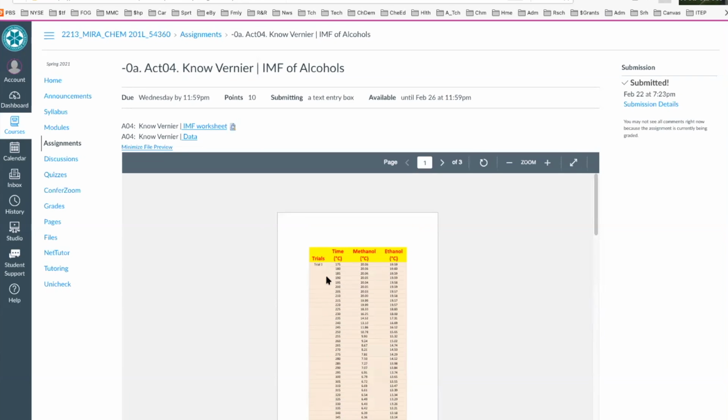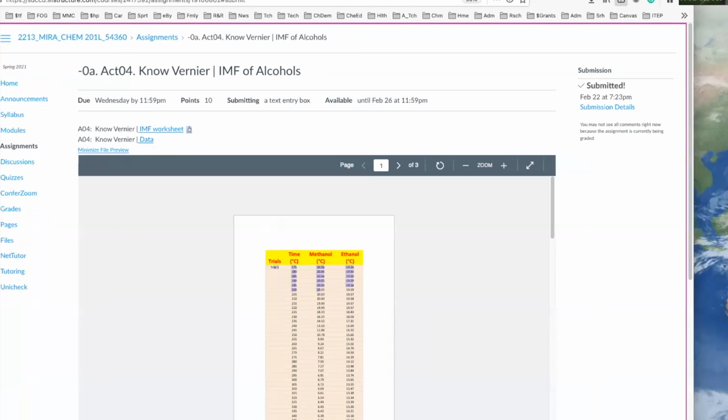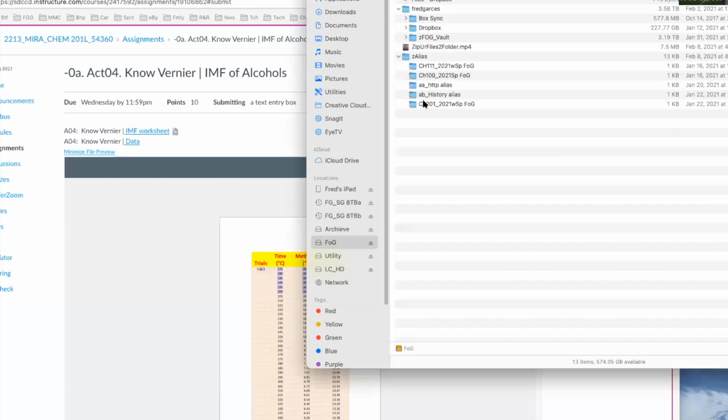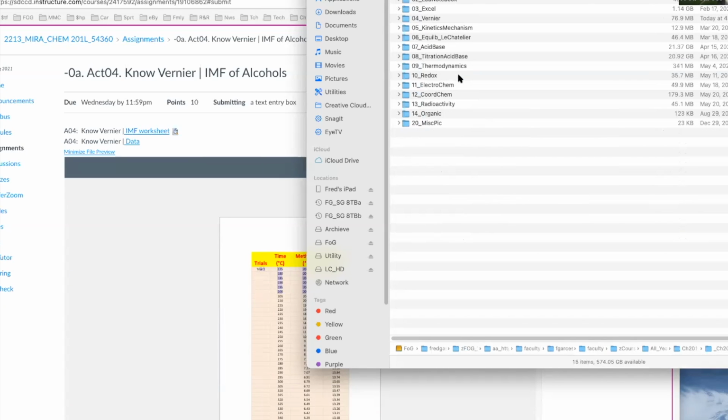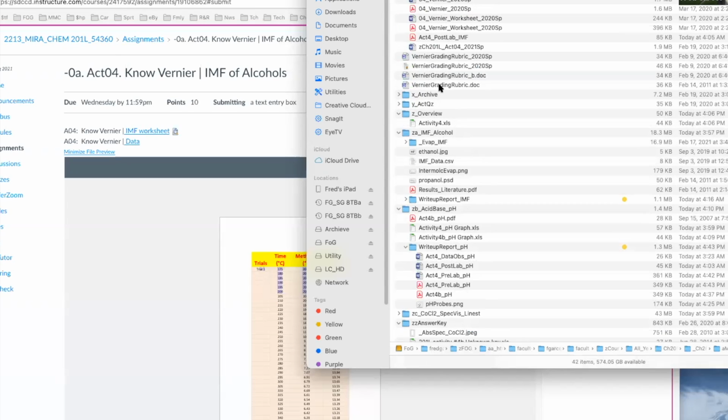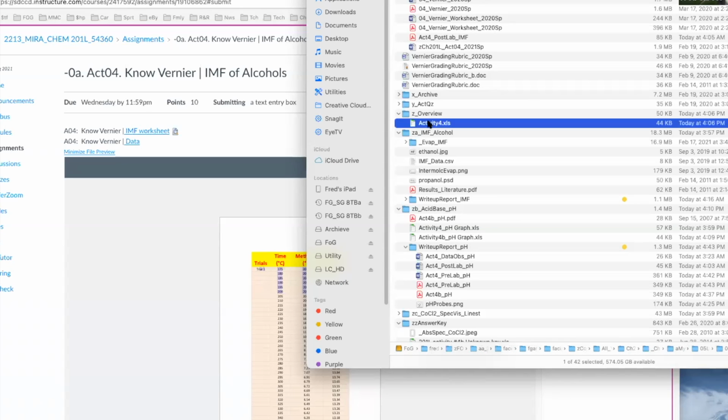if you look at these right here, let me see if I have that data. Okay, because I would prefer you guys to make sure that you have this in an Excel format. So I think we are here. We are here, and here it is, I believe, graph. It's pH. So let me open up Excel. Okay. I think you can copy and paste these things in Excel.